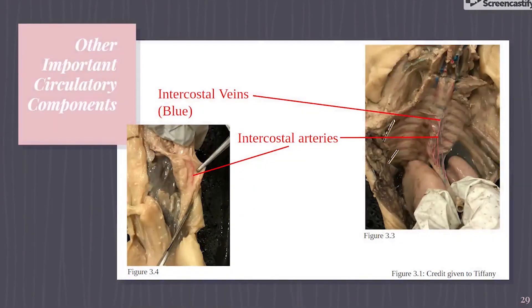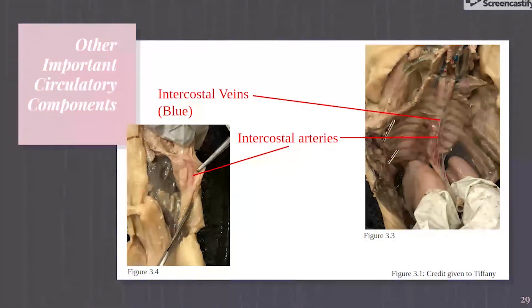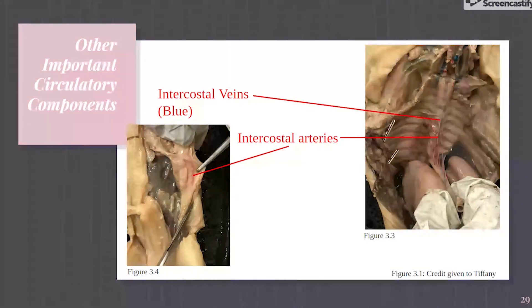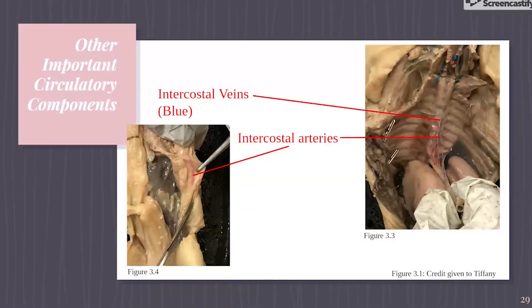You can distinguish between the arteries and veins based on their coloring. Arteries carry oxygen-rich blood, which gives them a red coloring. Veins, however, carry deoxygenated blood, which is why they have a blue coloration. Pictured in Figures 3.3 and 3.4 are the intercostal arteries and veins. They run on the costal groove of each rib and supply the intercostal muscles with blood and drain blood away.